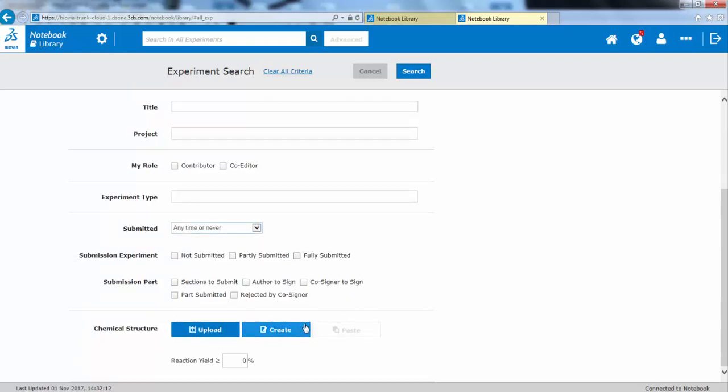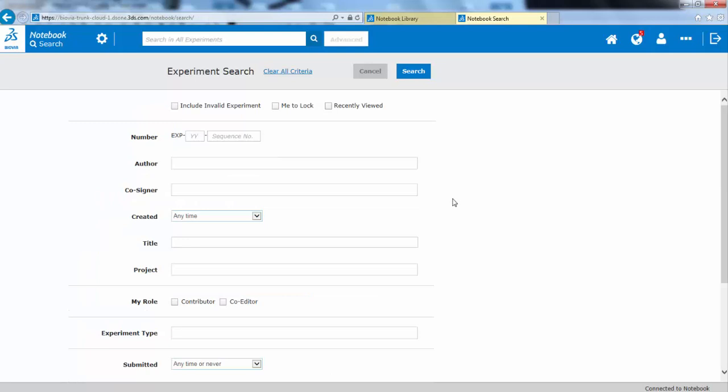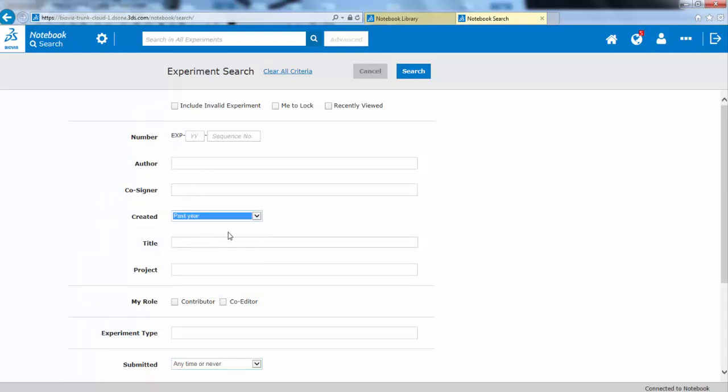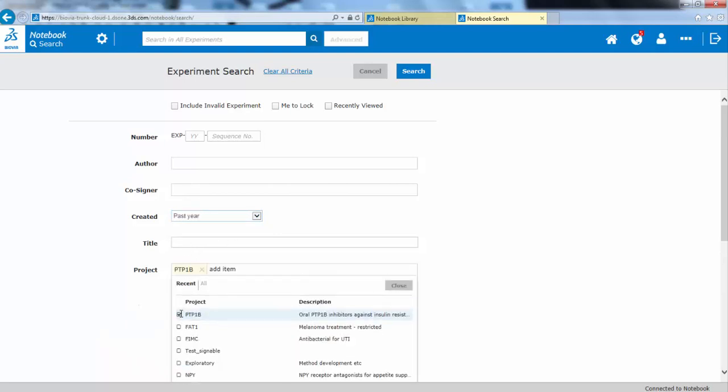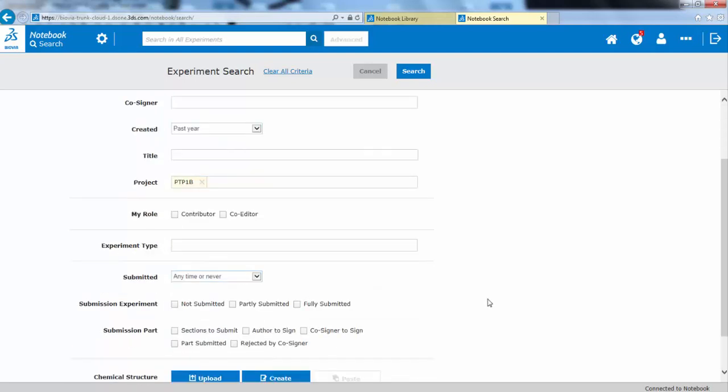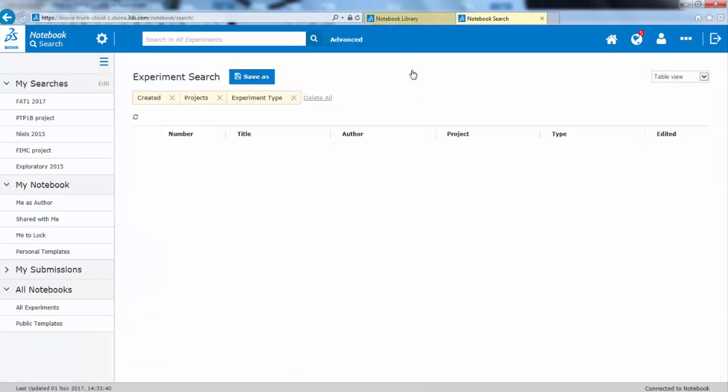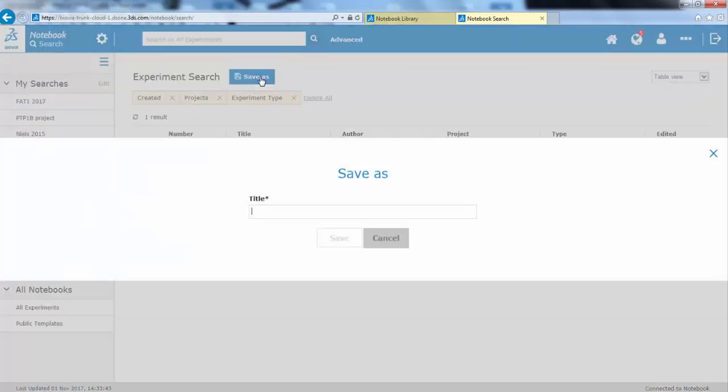You can also search by chemical structure. If you have any specific lookups, they would need to be replaced underneath here. You can perform a complex search as well. For example, you can look for experiments created in the past year, but in a particular project and confined to the experiment type by chemistry. And then you can also save this as a custom search.